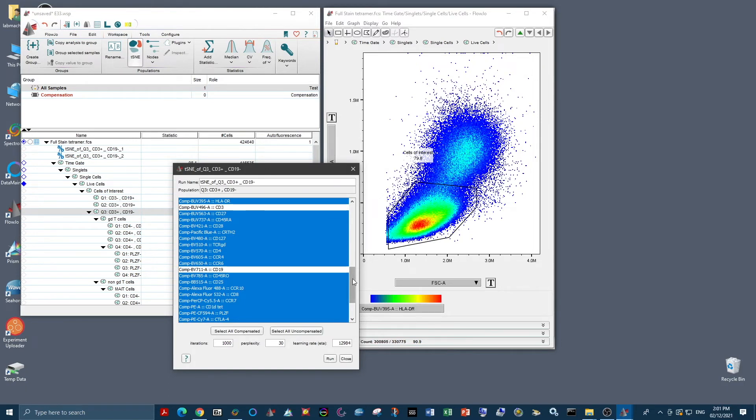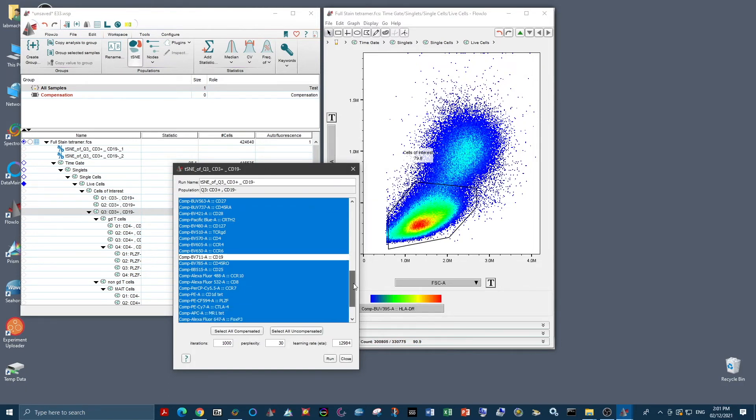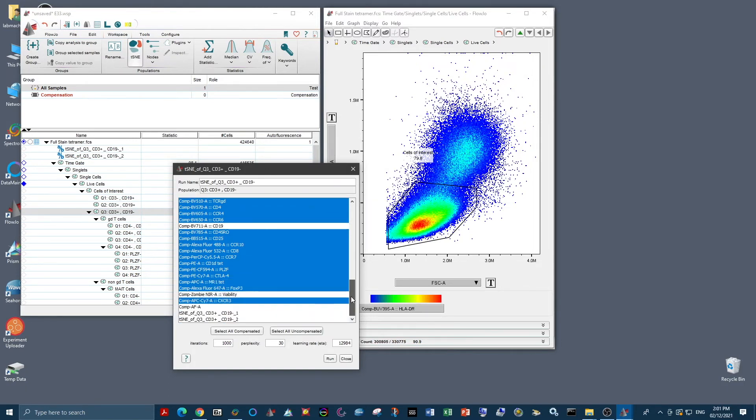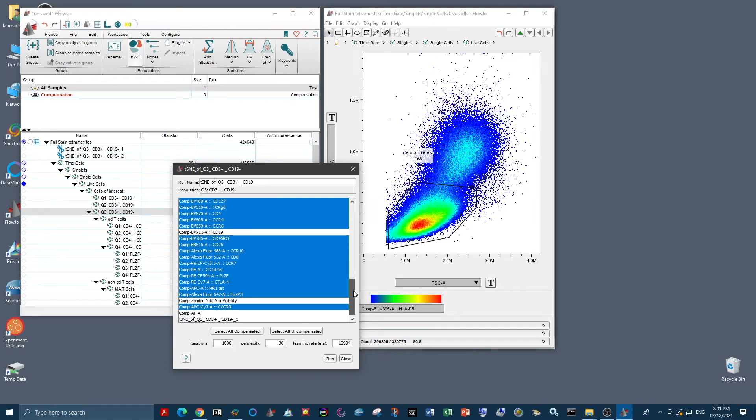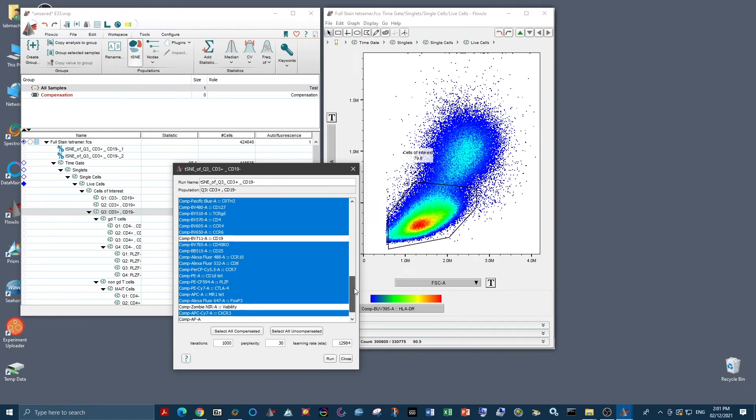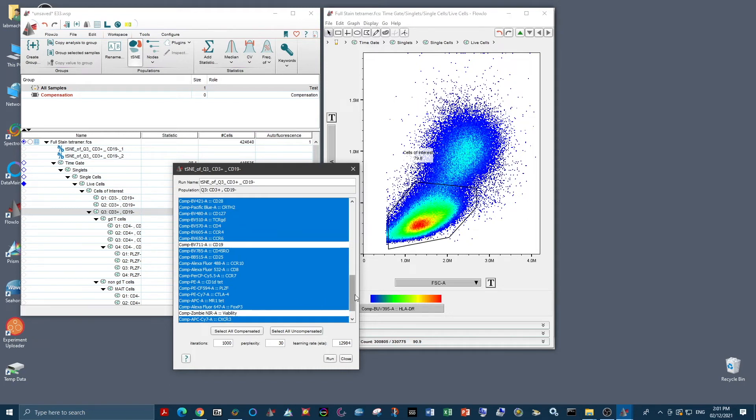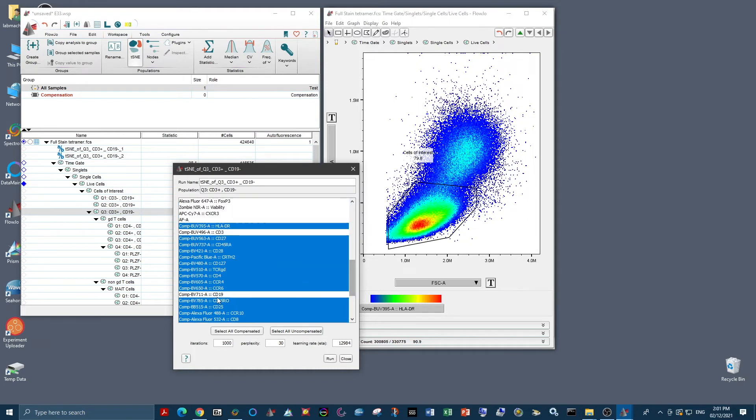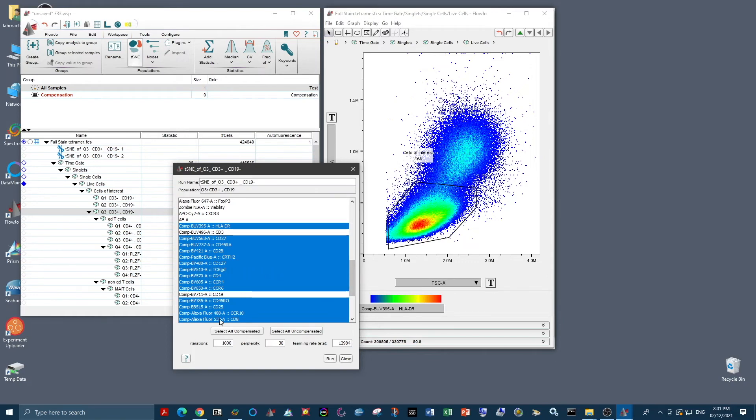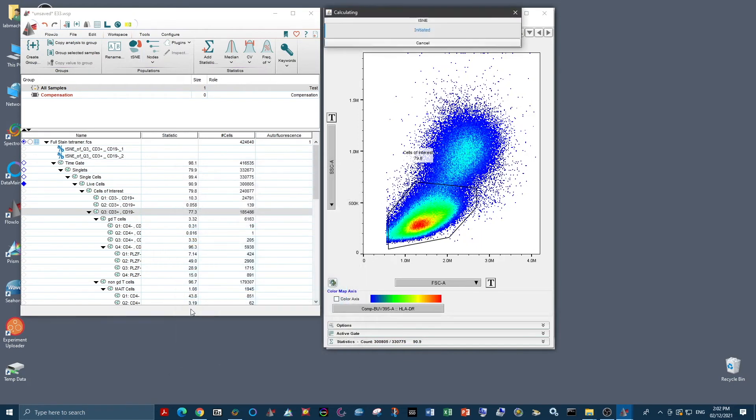Then we select the parameters that we want to use for our analysis. And obviously, we don't want to select any parameters that we've already gated on previously, such as our viability dye and the CD19 and CD3 parameters, which we used to gate on our cells of interest, which is our T cells. Now we're going to run the tSNE with basic parameters.